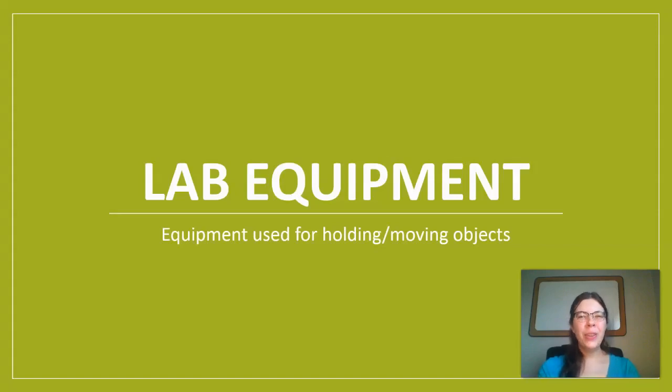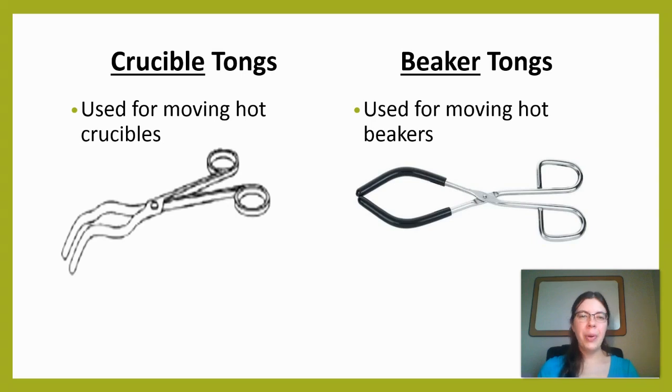Hi everyone, so in this video I'm going to go ahead and discuss different types of lab equipment, specifically ones that can be used to either hold objects or to move objects.